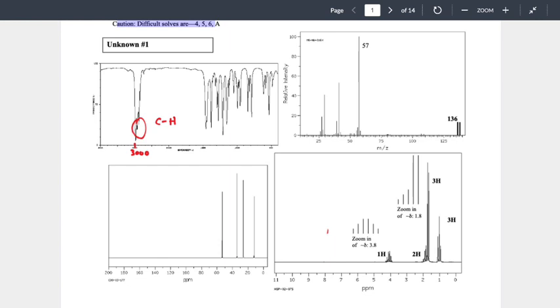Okay? What we're looking at with those numbers is the energy that we're firing at it. And when it hits the perfect energy to cause the bond to vibrate, the molecule absorbs it, and we see that now as a peak. If the energy isn't enough to cause the bond to vibrate, what happens? The light passes straight through, which is why we're getting 100% transmittance. Right? So it's just bond vibrations.